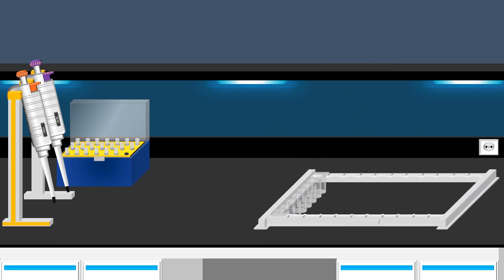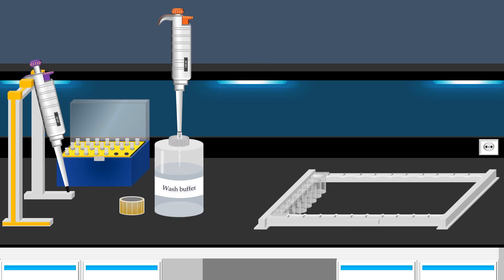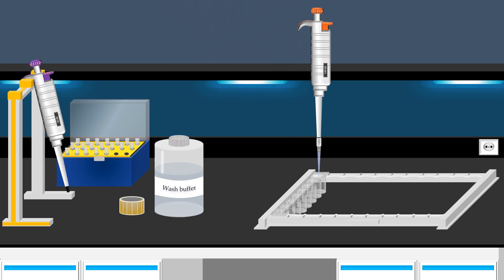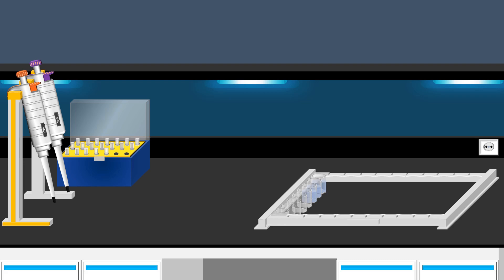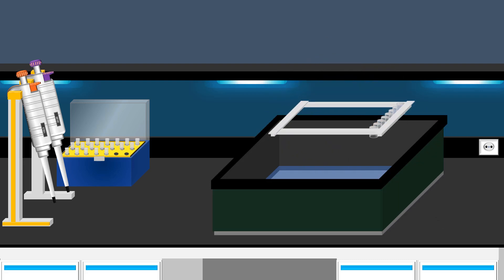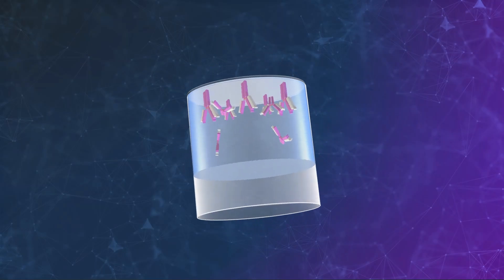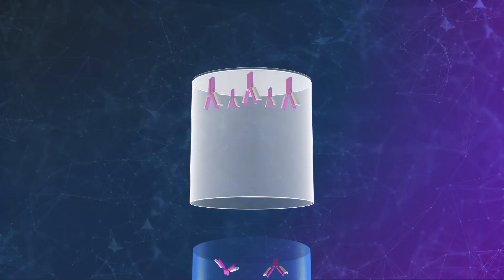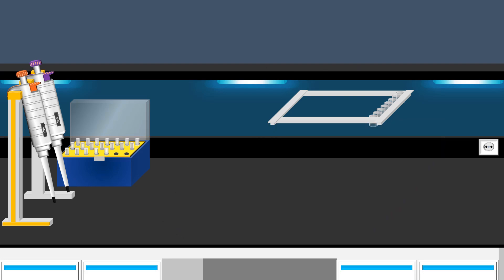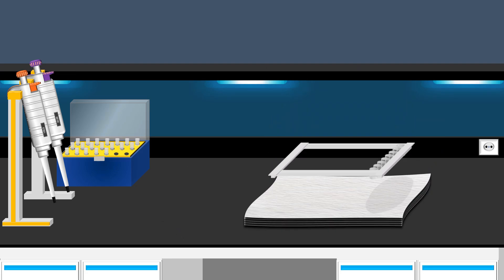Next, the wells undergo a thorough washing with a specially formulated wash buffer. This solution effectively rinses the wells, removing any unbound substances. Using a wash buffer helps eliminate any unbound antibodies. After discarding the wash buffer, an absorbent paper towel is used to remove any remaining liquid.